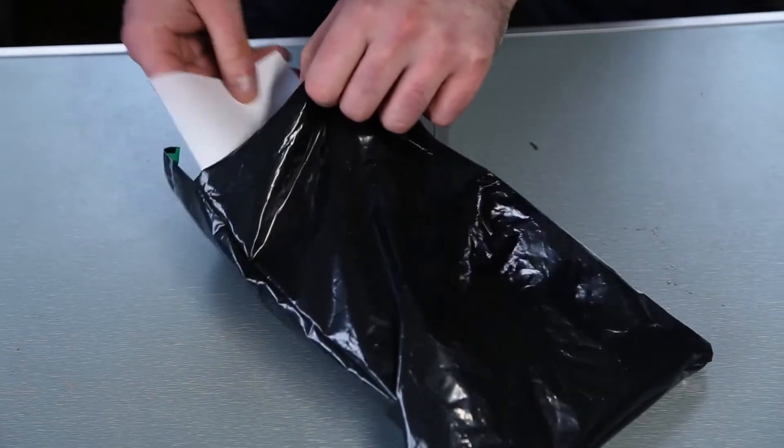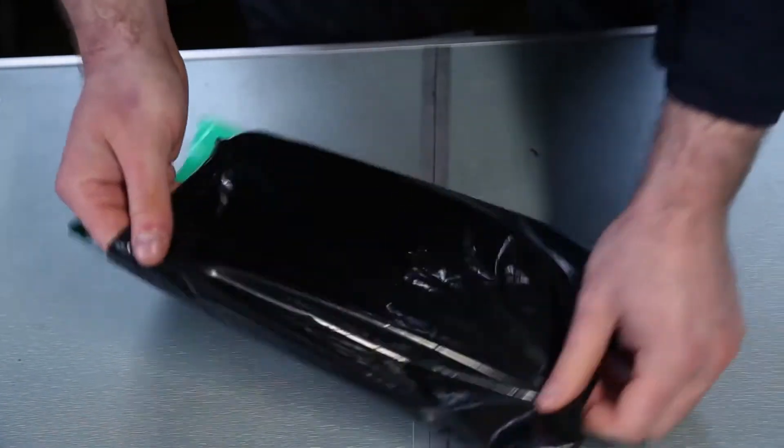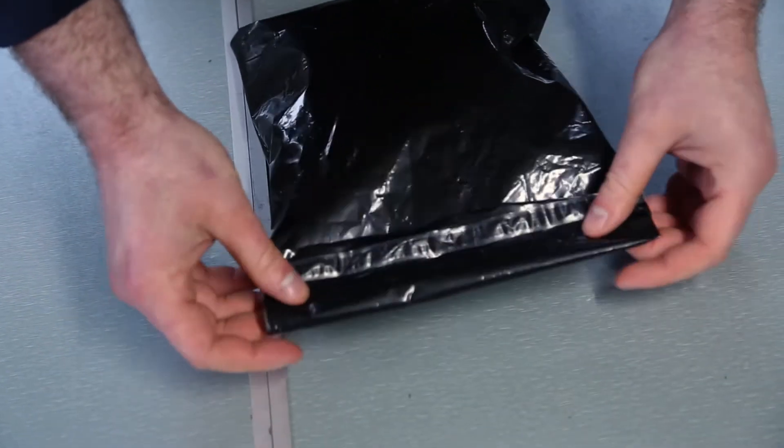Finally it goes into the lab bag to be sent off for analysis. Crucially, the cover letter is also added to allow the lab to identify where the sample came from. This sample is now ready to be sent — we'll send it away as soon as possible and hopefully should have an analysis report in the coming days.